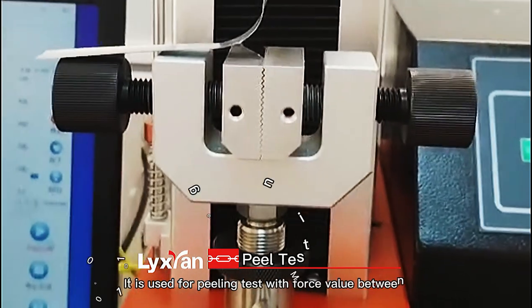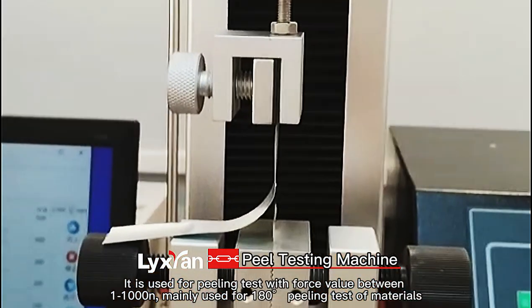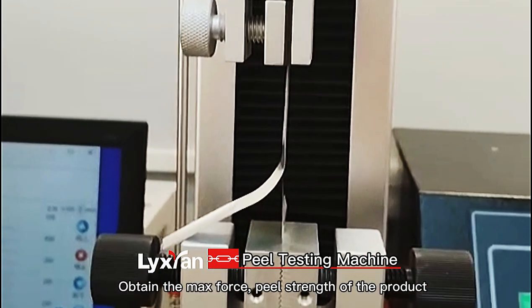It is used for peeling tests with force values between 1-1000N, mainly used for 180° peeling tests of materials. It can obtain the max force and peel strength of the product.